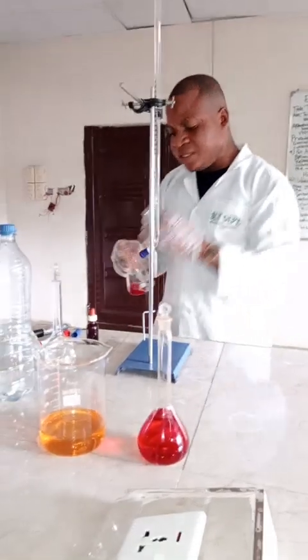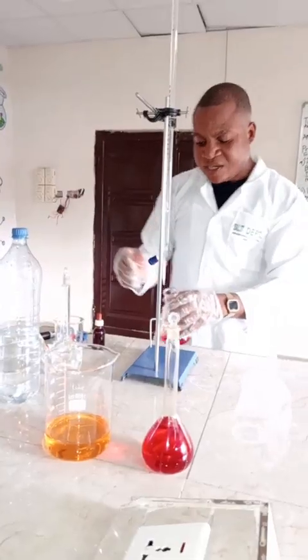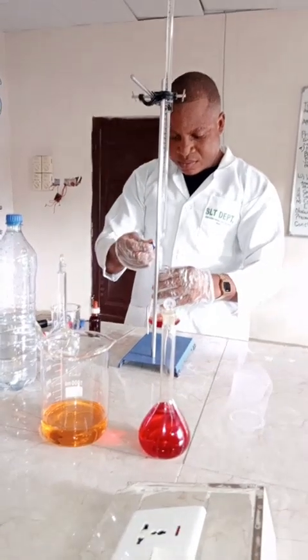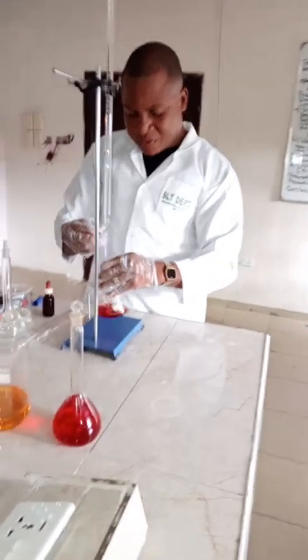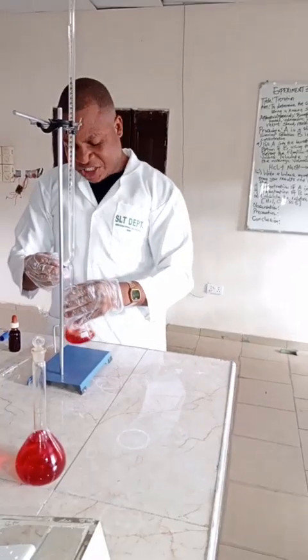Are you following? This is the remaining part of my base solution, sodium hydroxide. So I'm going to titrate it now. Titrate by swirling, continuous shaking until you note a change in color.